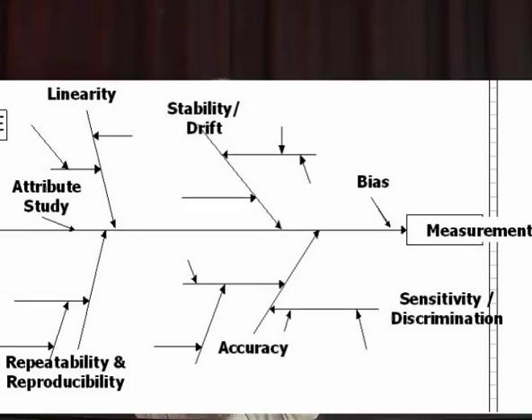So we move on to the next point that they worry about, and that is linearity. Now, for us, when we talk about linearity of an analytical method, it means something which we shall take up when we are discussing methods validation. But here, the gauge R&R analysts are talking about the linearity of the bias. In other words, they accept that if there is a gauge, over a period of time, its accuracy will start deteriorating and the difference between the observed value and the true value will start increasing.